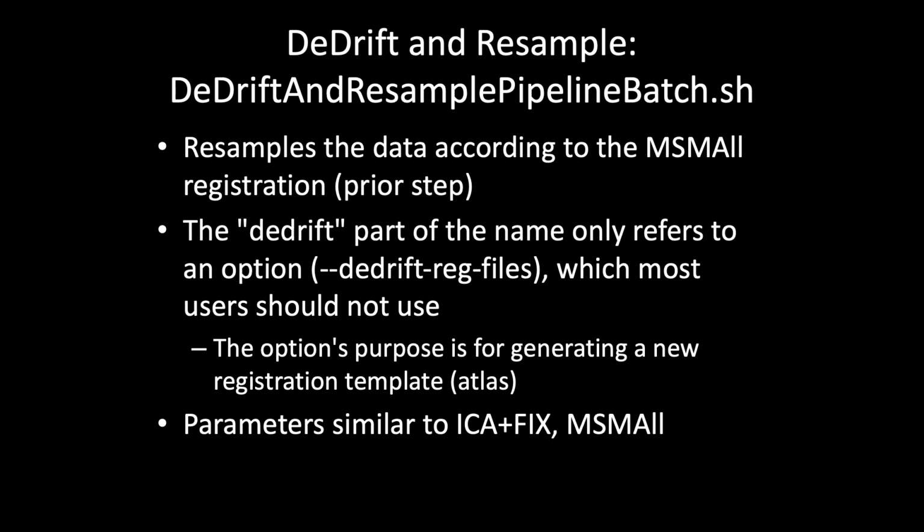The de-drift, that's not something that we're going to use, so we don't need to worry about that. It's mainly if you wanted to generate your own atlas. We're not going to do that.